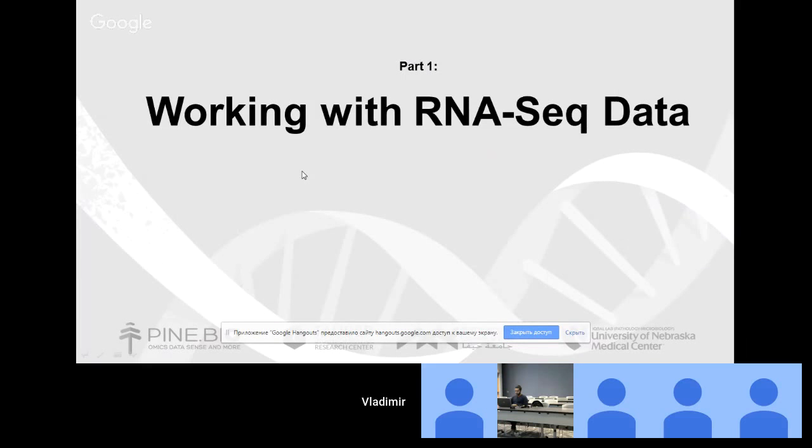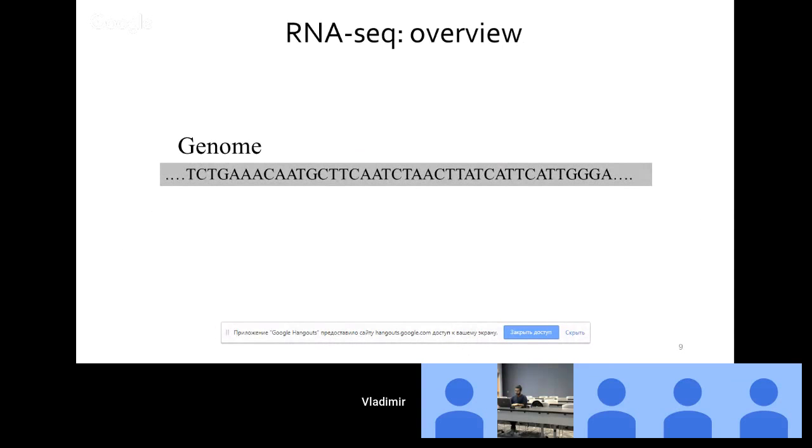So if it is okay with these points, let us start working with RNA sequencing datasets just from the beginning. In order to understand the processing of RNA sequencing data, we first need to understand the scheme that is used at a wet lab level to process all these data, to prepare FASTQ files.